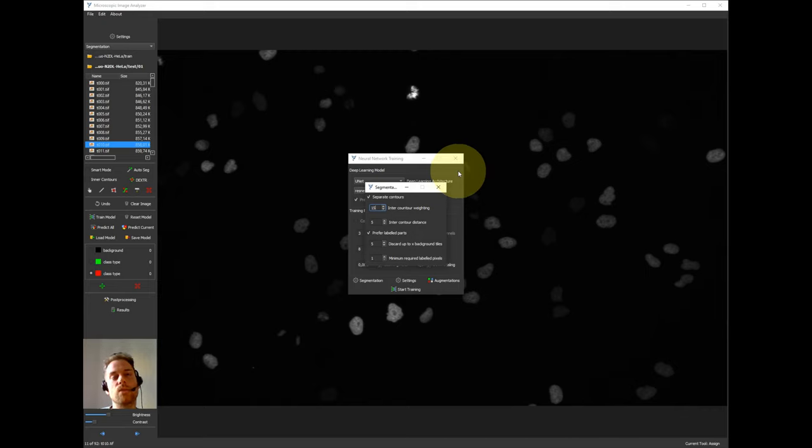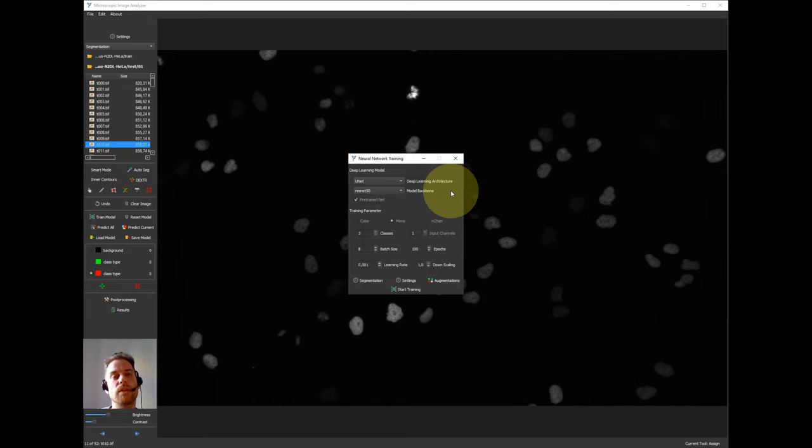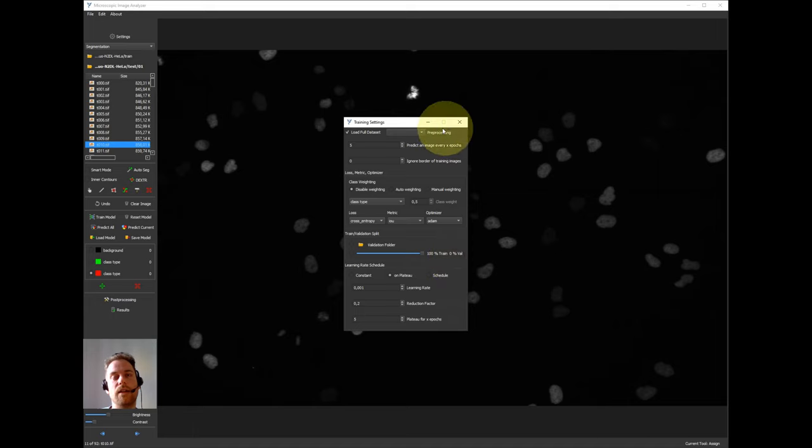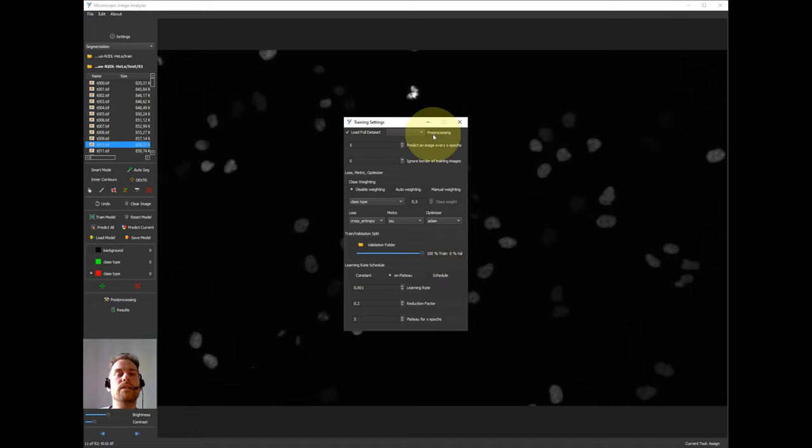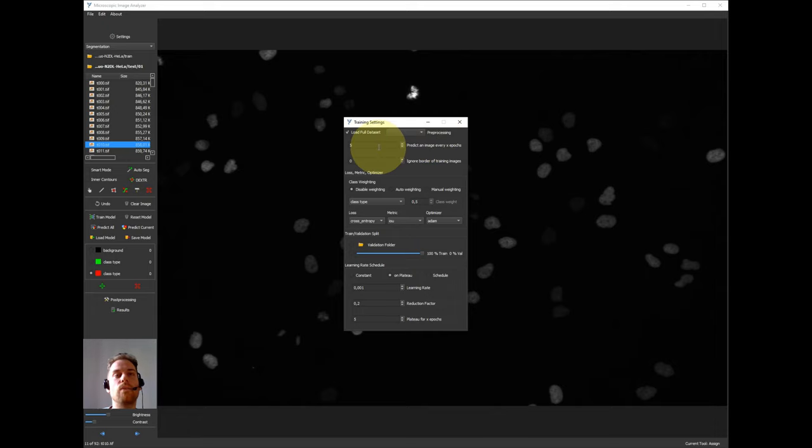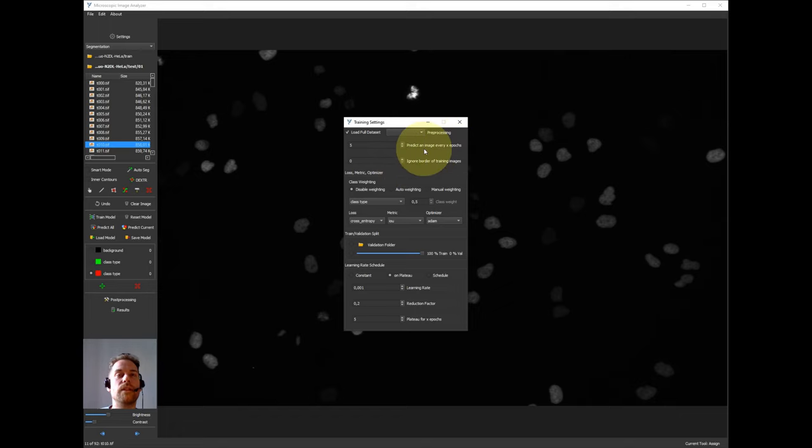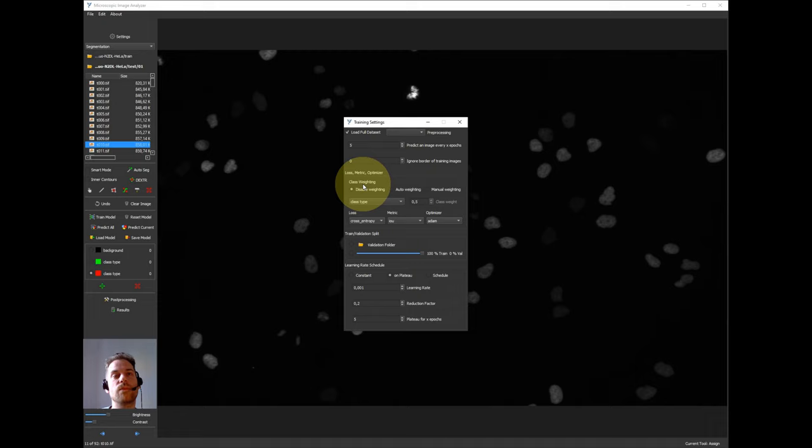This will help us because we saw from the first model that there are some when we have very close cells that they are resulting in like one object. We can set the pre-processing but we can leave it here because we use a pre-trained model anyway so it will be overwritten by the software. We can leave the predicted image for every fifth epoch as we have seen in the first training to monitor our training.